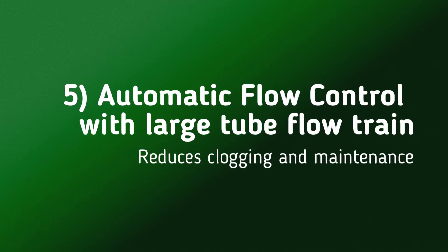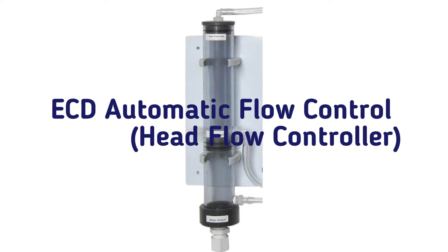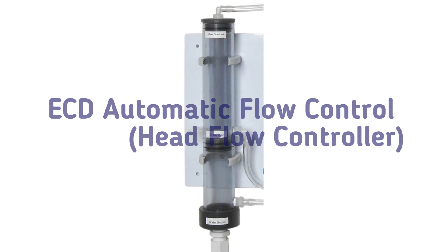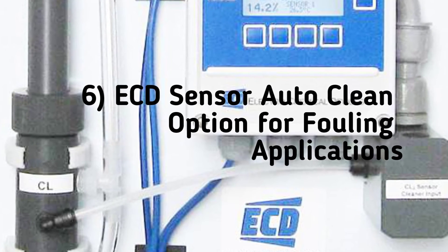Clogging and maintenance times are reduced with a large tube flow train. A head flow controller eliminates the need for pressure and flow regulators. Fouling is eliminated with the optional solenoid and spray cleaner.